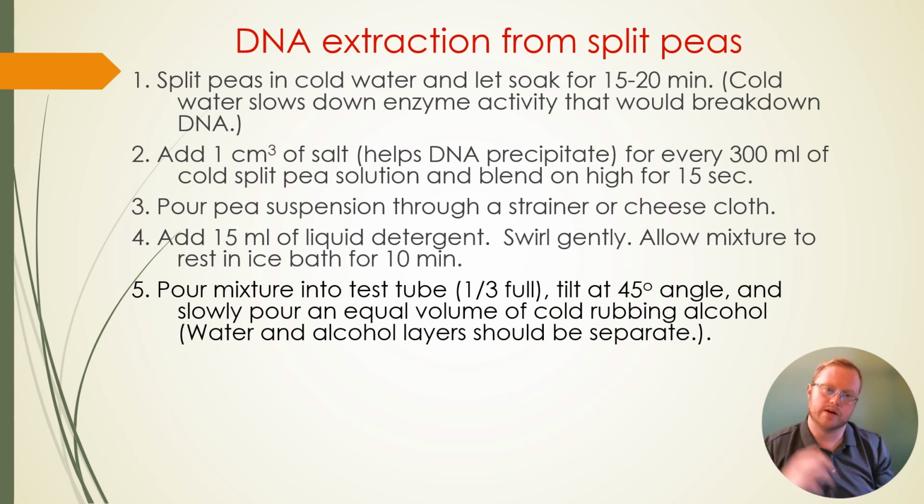This bilayer is going to help to pull the DNA out of solution, and it's going to look like clear snot. And you're going to use a toothpick or a coffee stir, and you're just going to swirl that around gently, not to mix things, just gently, and you're going to gradually wind that DNA around the toothpick or the coffee stir.